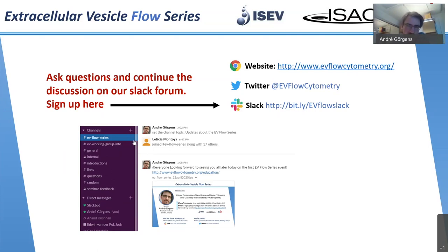Related to this, we have also looked into 10 different biological fluids and are looking into an approach to analyze those without a lot of processing, which is in many cases possible. You get quite some diversity between body fluids in terms of marker expression, but some are indeed prone to background, especially blood plasma or serum. That's also included in the first paper we had, where Josh had a look at purified versus non-purified plasma and serum EVs at different doses. Maybe check that out. We see sometimes bead populations coming up as false positives, so that's something we need to control for.